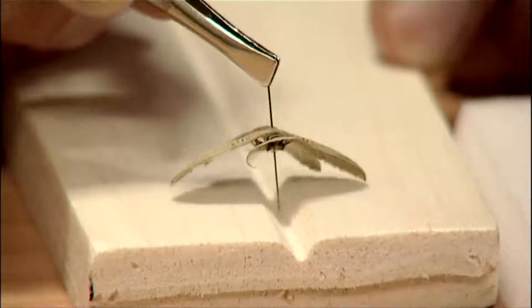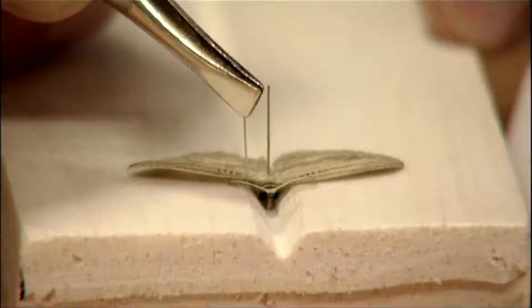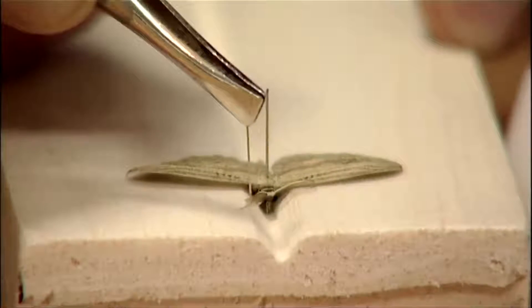So I pin the body of the moth into the groove until the wings are just level with the surface of the board. The next thing I do is pin the antennae forward so that they're out of the way of the wings.